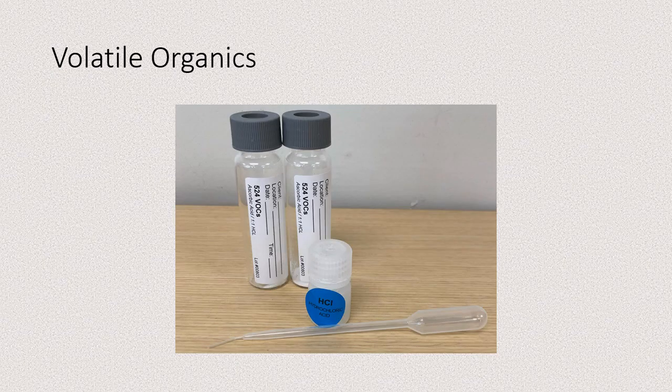Here's the kit you'll get for volatile organics — notice there are two bottles. We need the extra one in case one breaks or fails quality control parameters. Fill the bottles about three-quarters full. There's a medicine dropper and a small bottle of acid. When it's three-quarters full, put five drops of hydrochloric acid into it, then fill it the rest of the way and turn it upside down to check for headspace.